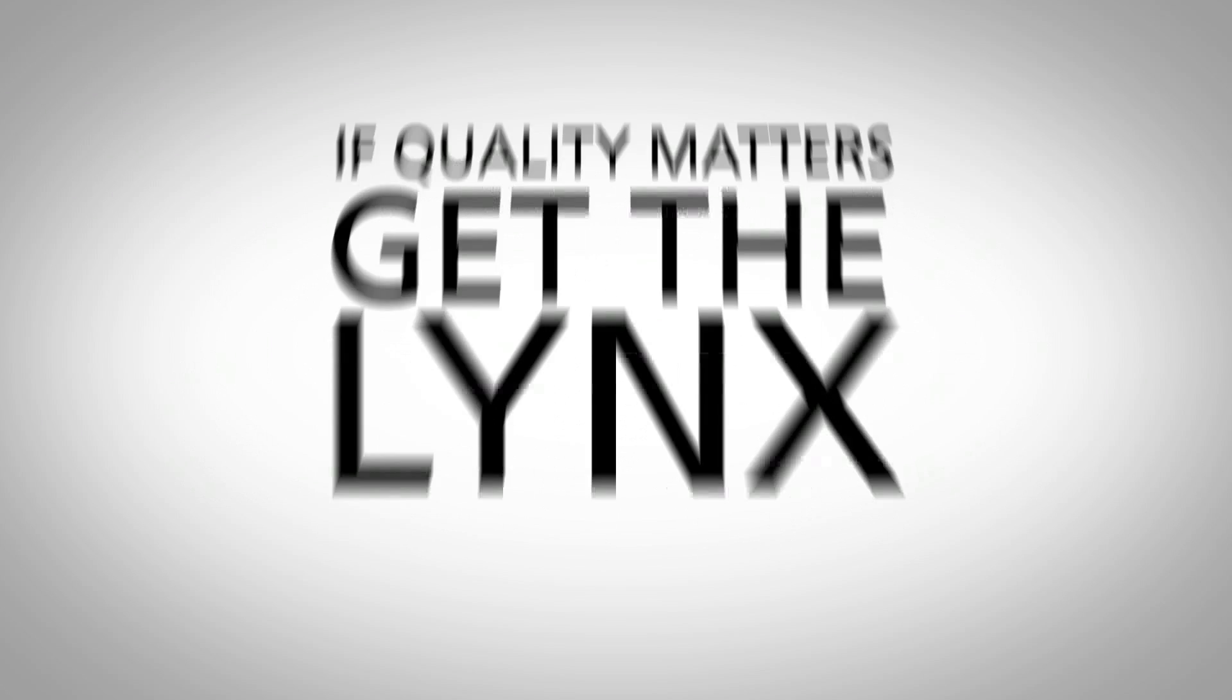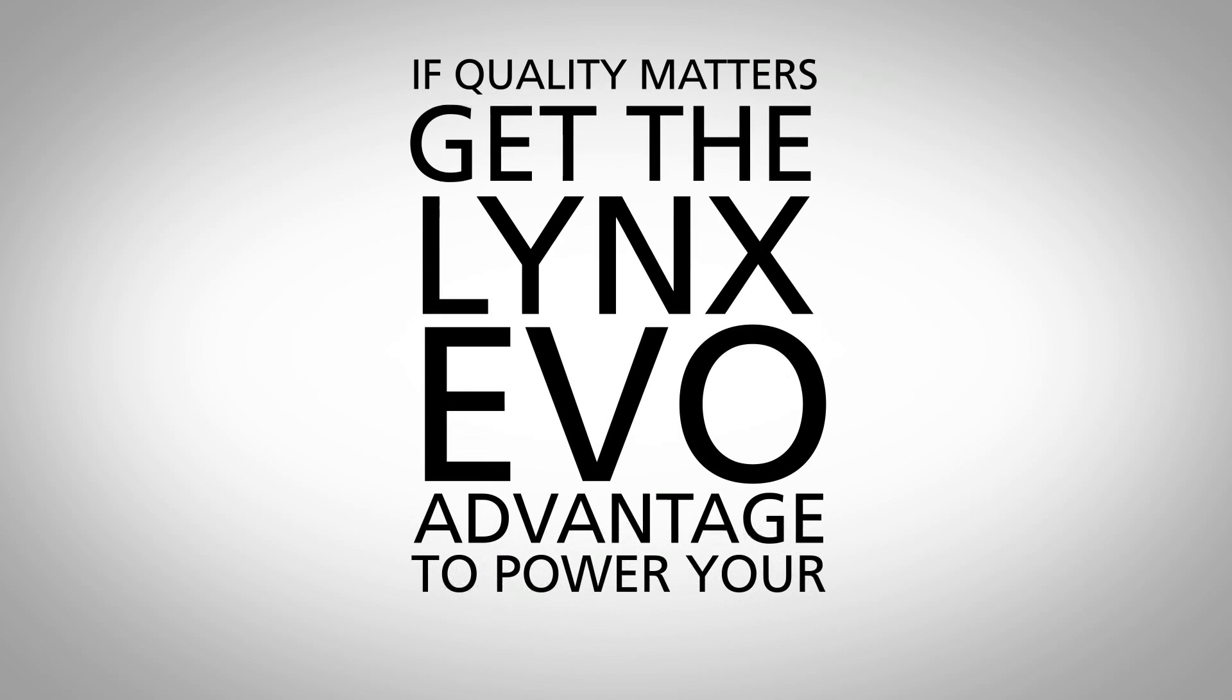If quality matters, get the Lynx Evo advantage to power your productivity.